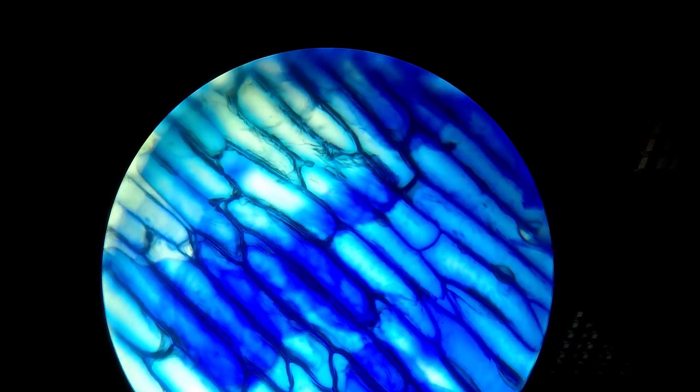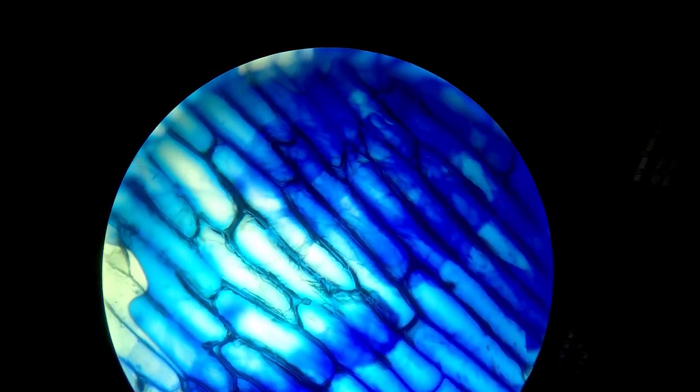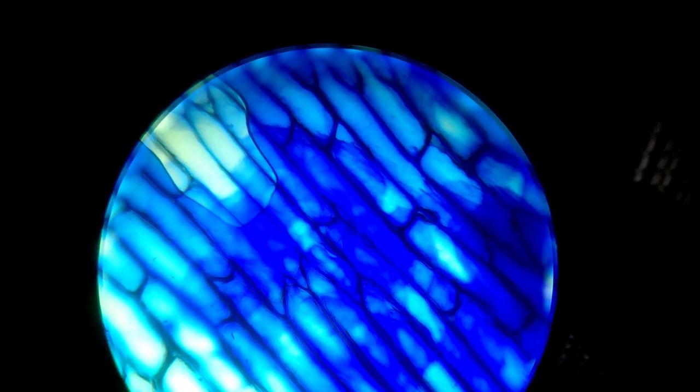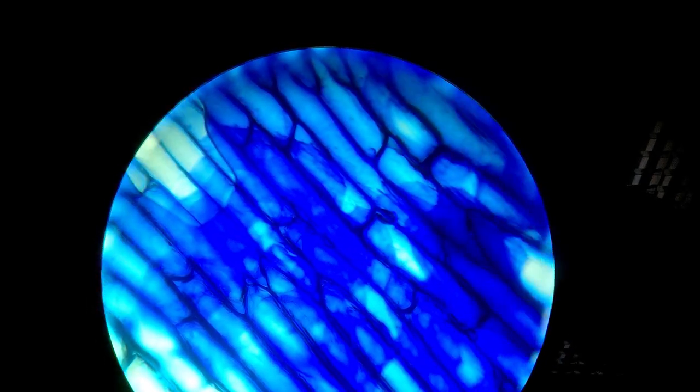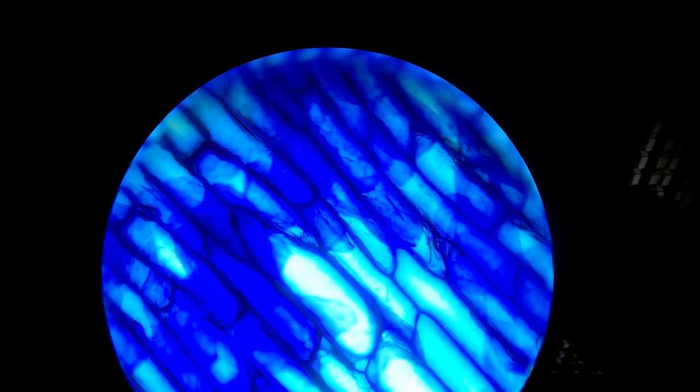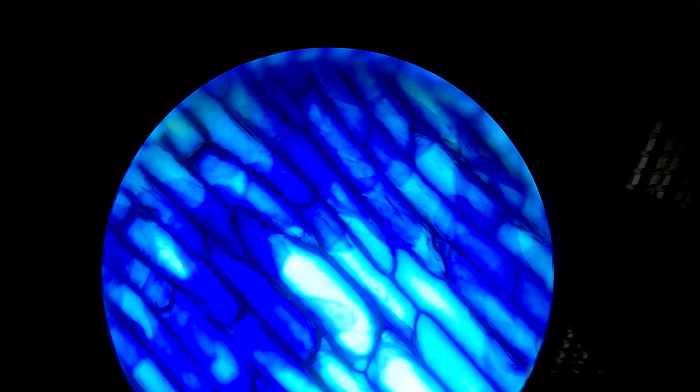Now you can see that our cells are stained with methylene blue and they have a distinct cell wall and we can distinguish between these cells. Actually, we have a single layer of cells in this onion skin.